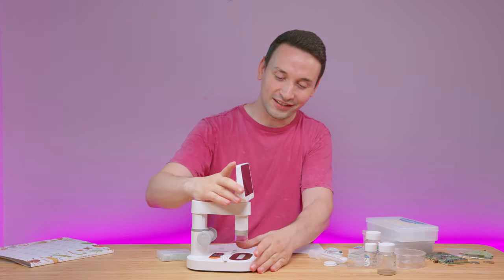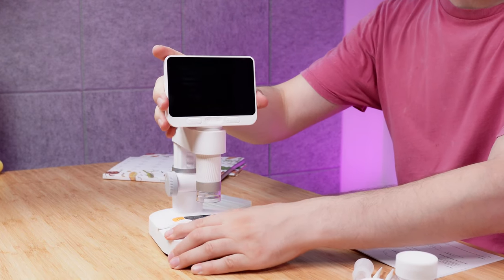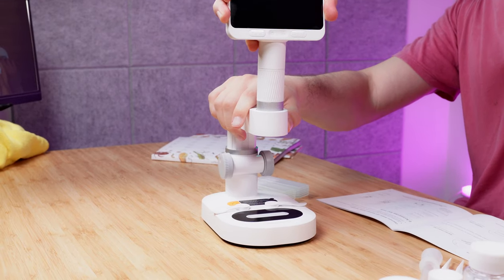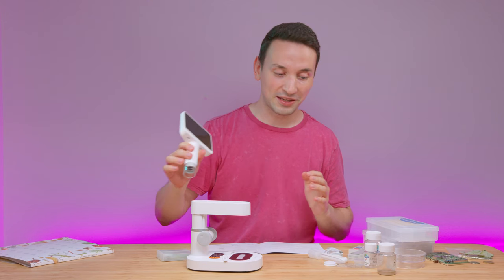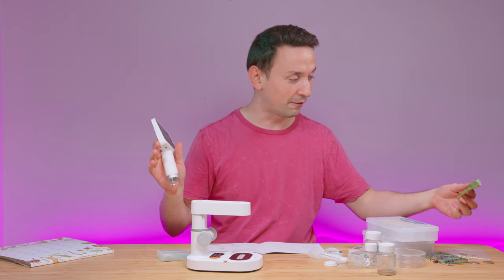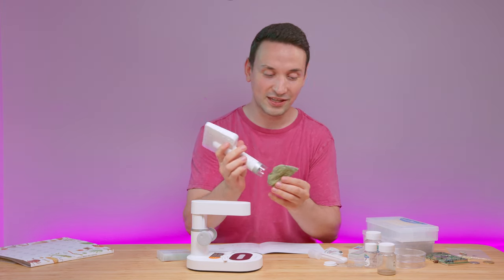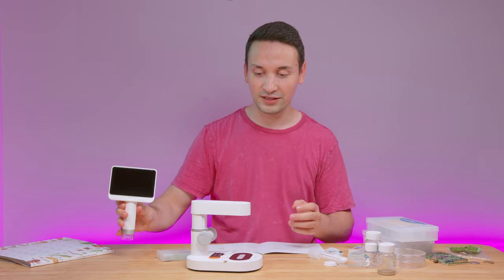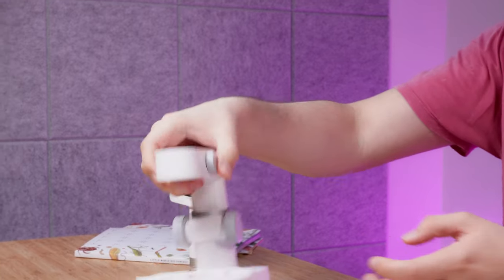Looking at the actual unit itself, you're able to detach the main microscope from the base. If you just pull it out, you can grab it and bring it with you — so you can go outside and look at a leaf or anything you really want. You can use it standalone.